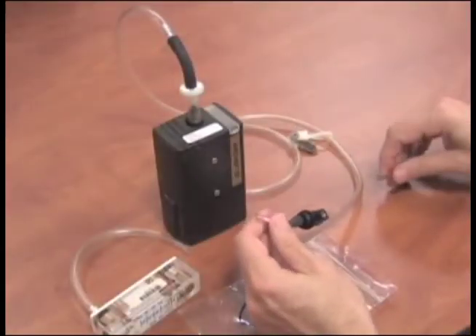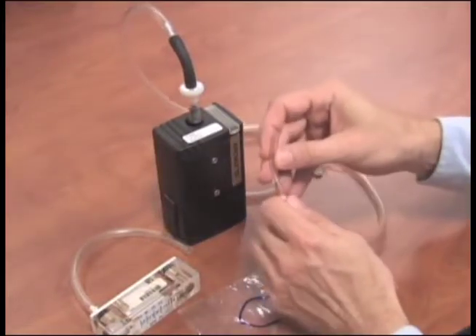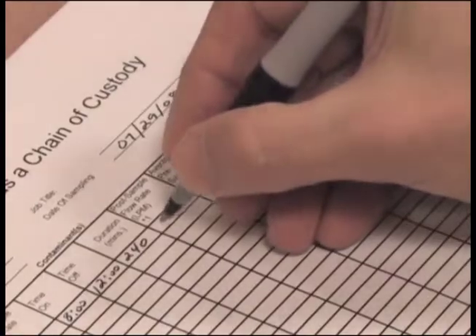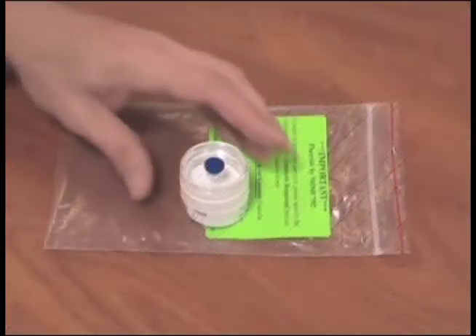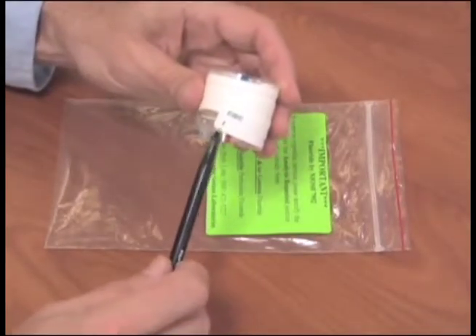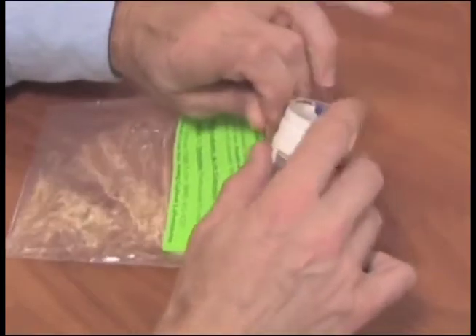Perform a post-calibration following the same process used for pre-calibration. Then record the flow rate on the pump calibration sheet. Place the filter cassette with the sample ID label in the ziploc bag for shipment to Galson Laboratories. Then complete the chain of custody form.